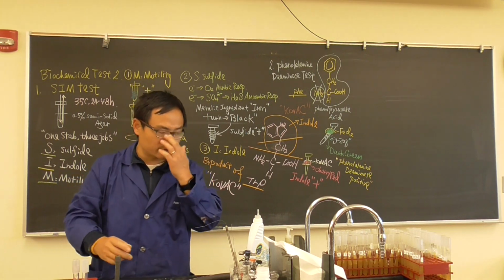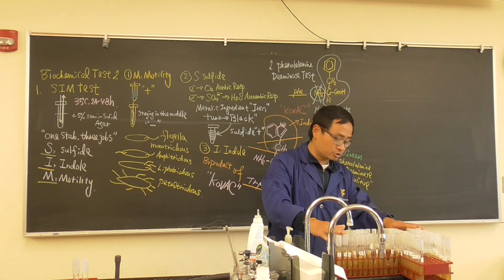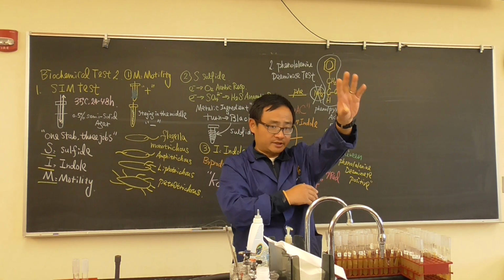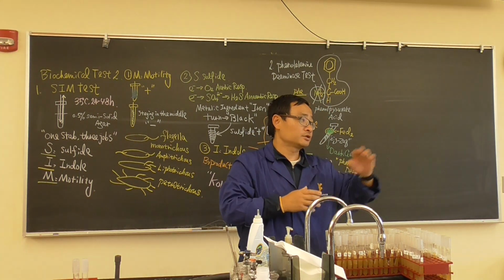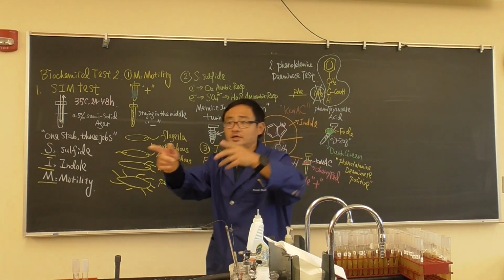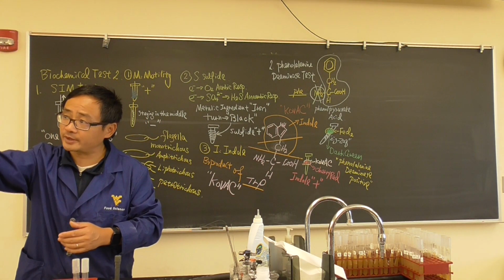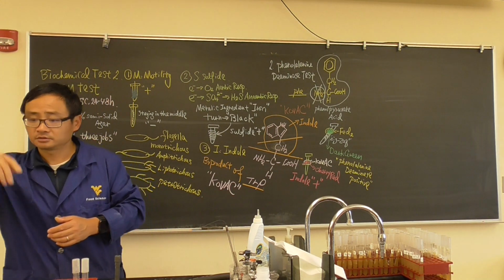Now, we're gonna assign the bacteria. We're using the same ones: E. coli, Bacillus, Lactobacillus, Citrobacter. So on every bench, the first two of you do E. coli, followed by Bacillus, Lactobacillus, and the last two do Citrobacter. So E. coli, Bacillus, Lactobacillus, Citrobacter. Okay, the same thing here.